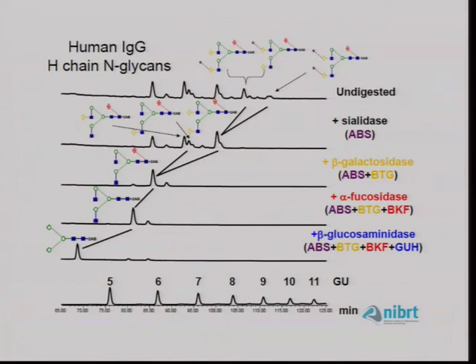And if you do, either they're slight residual peaks because the last enzyme, this one, is very hard to get to go to completion, or it means that you've got a structure there that is not reduced with these enzymes. For example, if you had mannose structures here, they would still remain in their original position because there's no mannosidase in these arrays. So this is a really important fail-safe. It's not like mass spectrometry where you have to tell it what to look for. This is unbiased. It's going to look for what it finds, and if there's anything left, it's telling you that whatever's left you have to look at further because it's not being reduced to the trimannosyl core. So if you had a phosphated sugar, for example, it wouldn't be reduced.